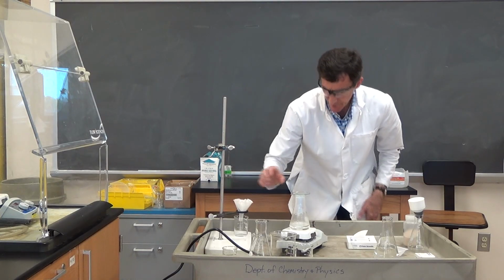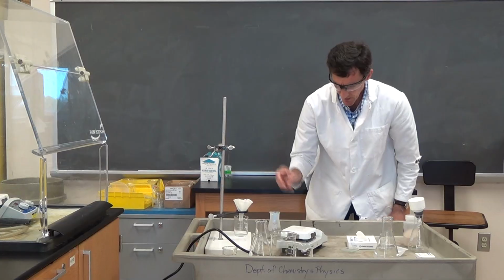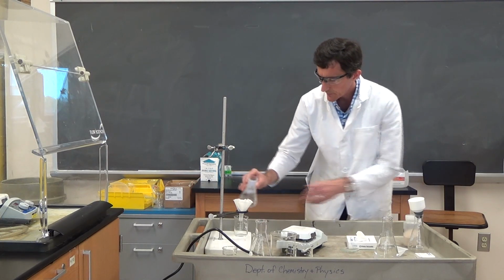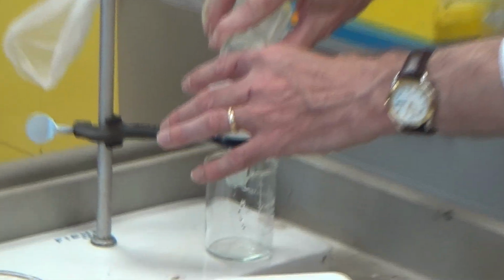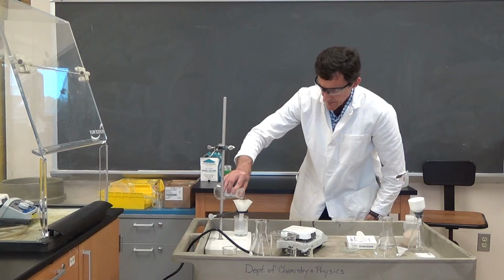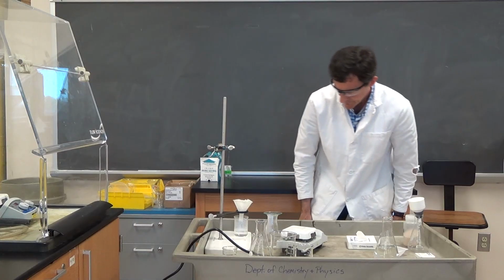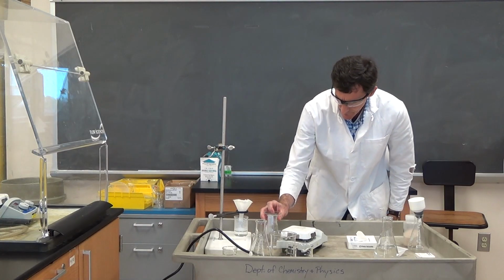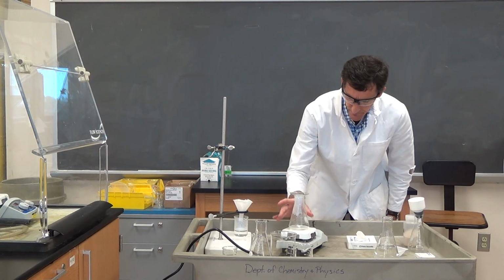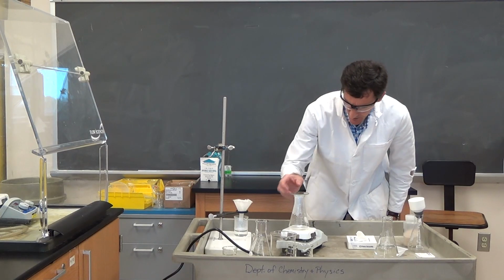So now we're ready to hot filter. We can take this off. It's a little hot because it's 100 degrees. I'm going to turn my hot plate off. I'm going to pour this through. Just going to pour, keep on pouring. Pretty hot here. I'm going to set it down kind of hot. Keep it covered. Going through. Depending on how long you have to sit, you may let it keep warming. You don't want your compound to crystallize. So that went through pretty well.